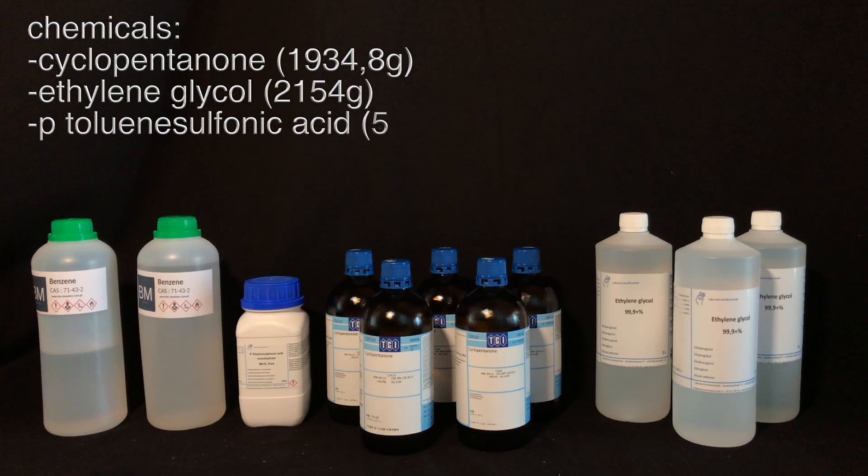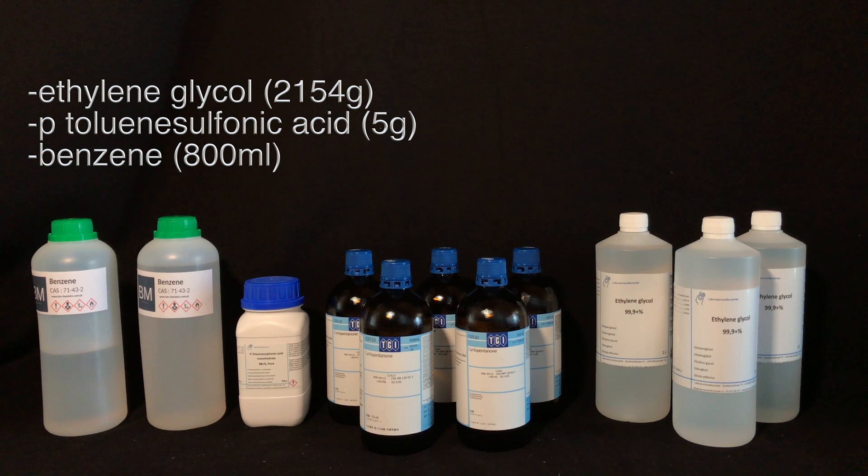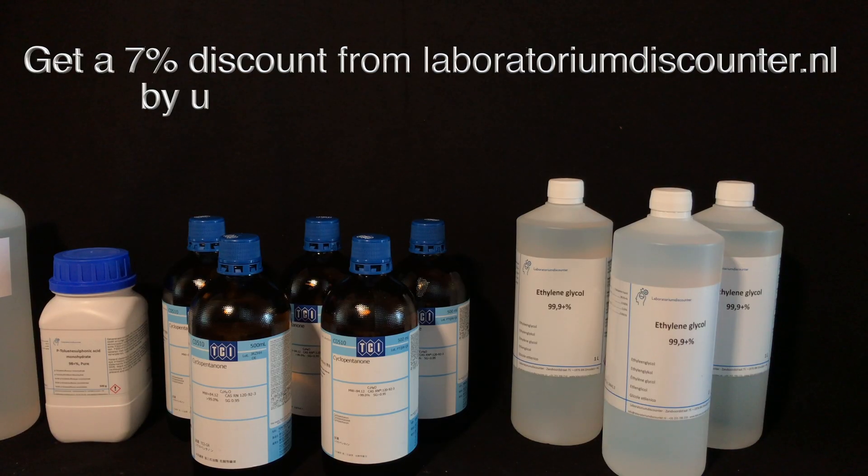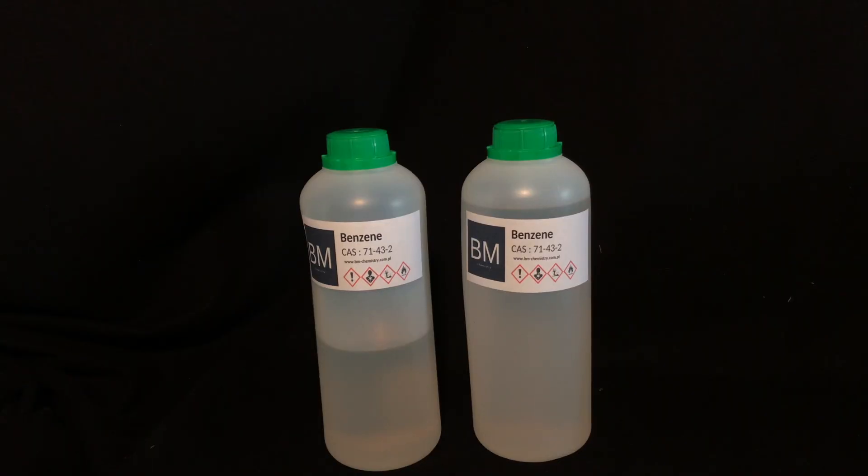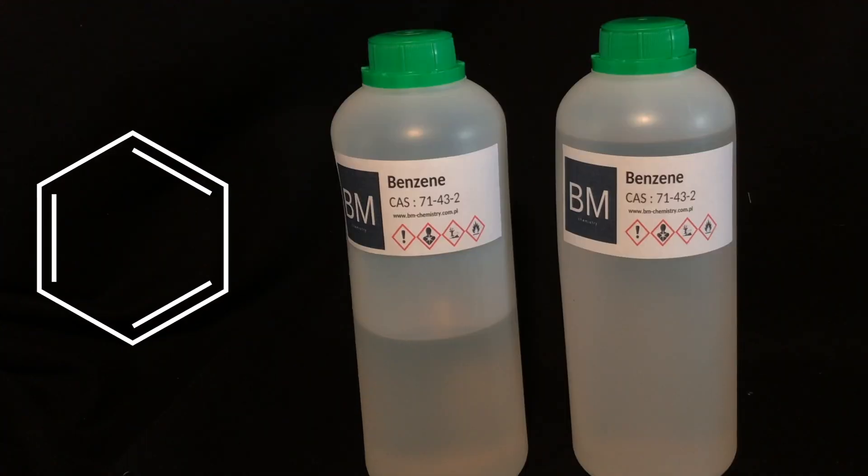For this synthesis we may only need four chemicals, but we're going to use a lot of each one. The most important ones are cyclopentanone, ethylene glycol, and p-toluenesulfonic acid to act as a catalyst. The reaction creates water and we will want to remove that, and therefore we're going to use an azeotropic distillation.